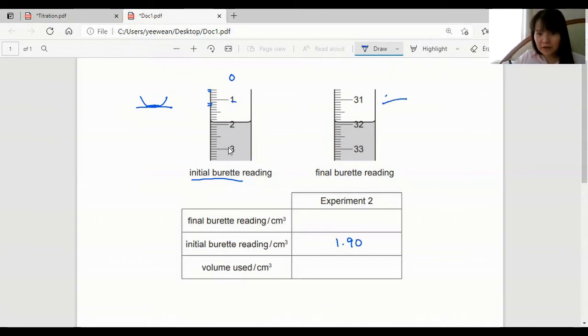And as for the final burette reading, so this is 31, 31.5, 31.9, and the volume used.